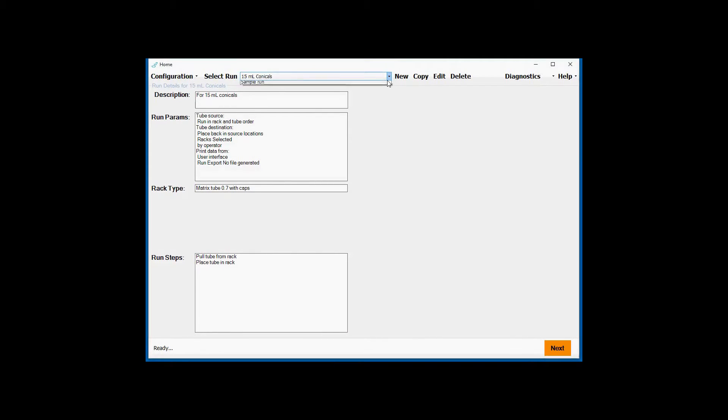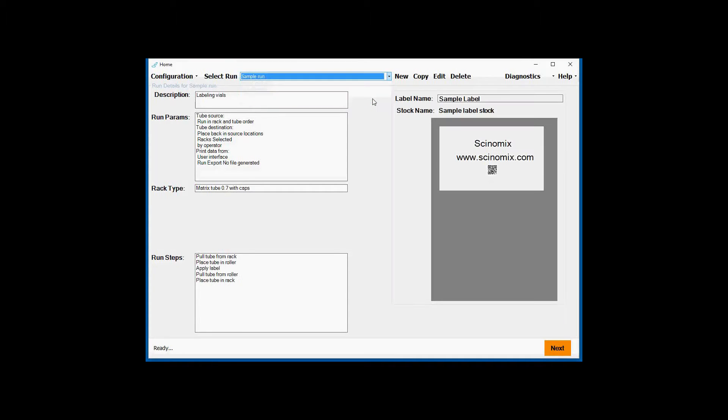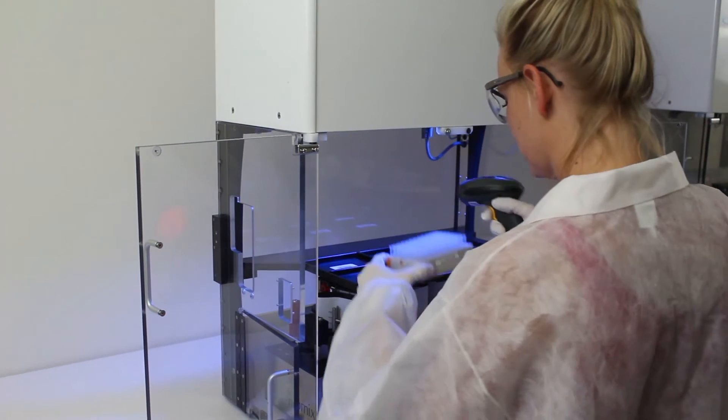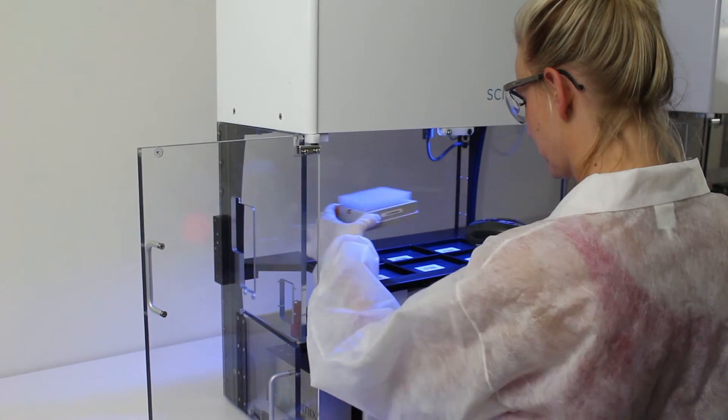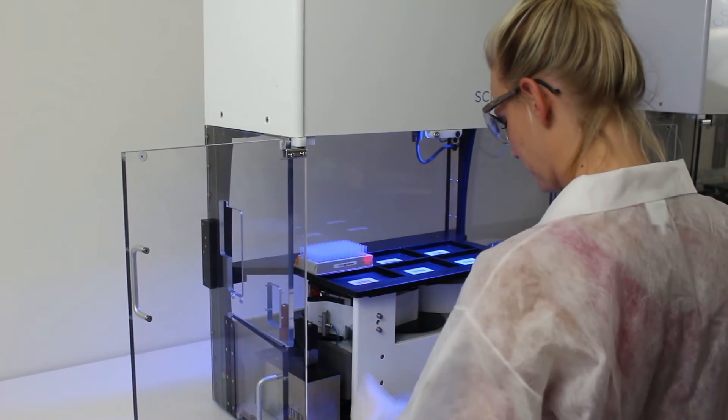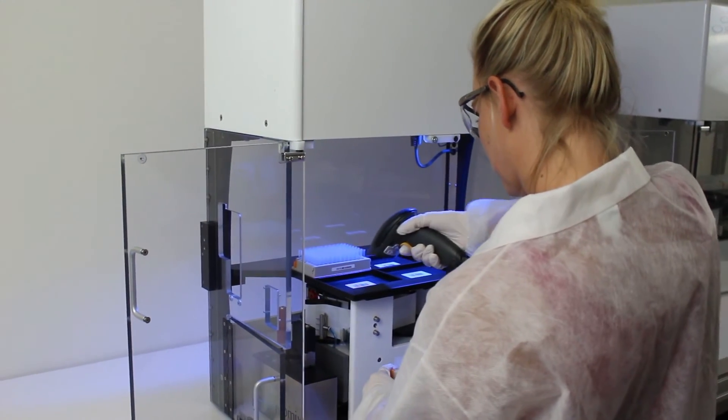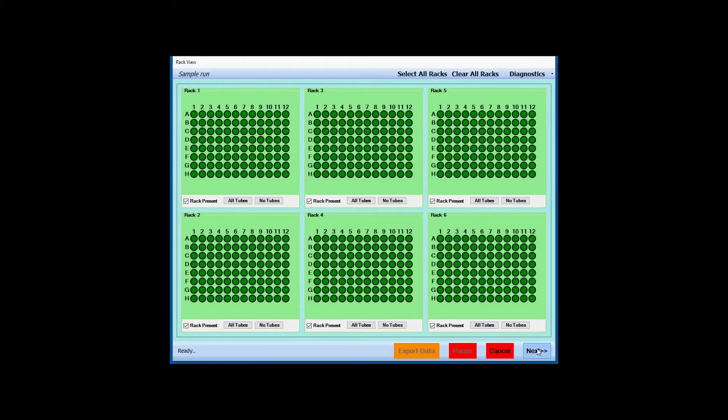After configurations are set up, the run type is selected from the drop-down menu on the screen. Racks of vials are loaded onto the work deck positions. Racks of vials can also be scanned as they are loaded and data retrieved from a LIMS if required. The run is then started.